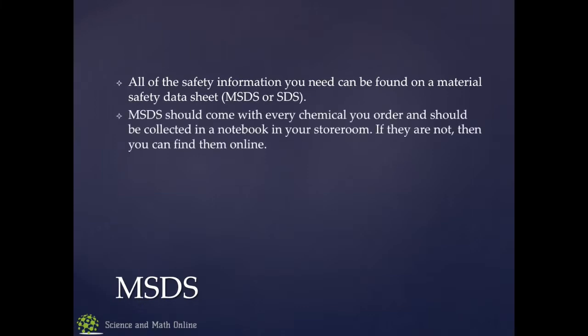So all the information that you need can be found in this. It's not always the most concise way of doing it because it has a lot of stuff that's more industrial than you need, but this is a material safety data sheet. That's what MSDS stands for. Sometimes just safety data sheet, SDS. They come with every chemical you order.